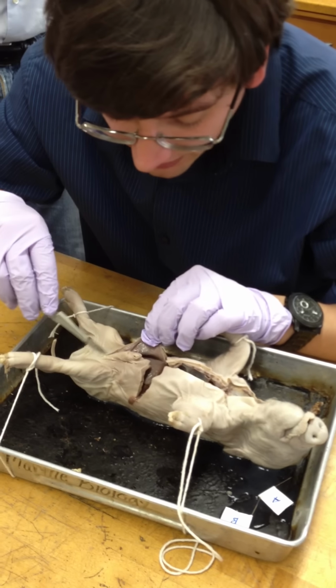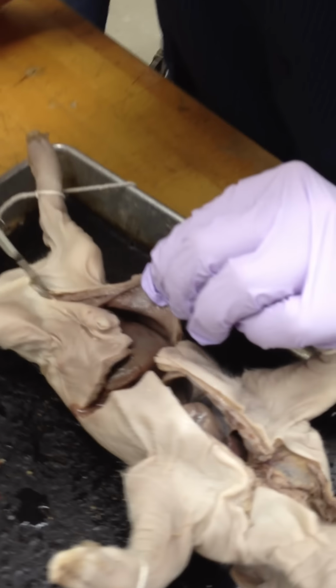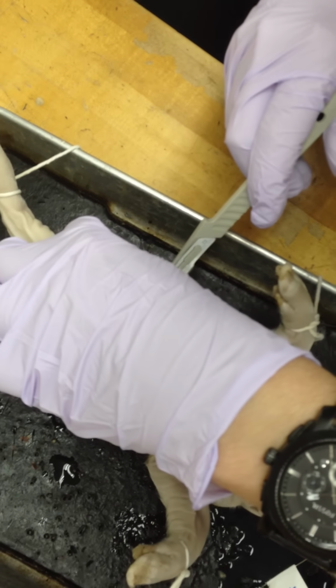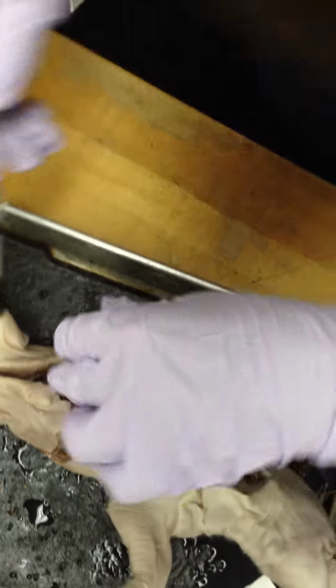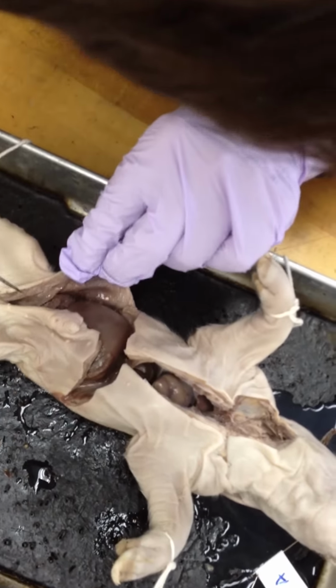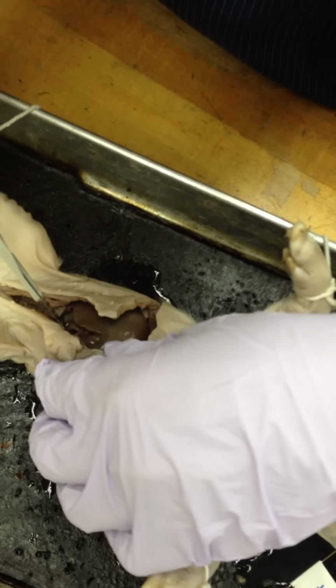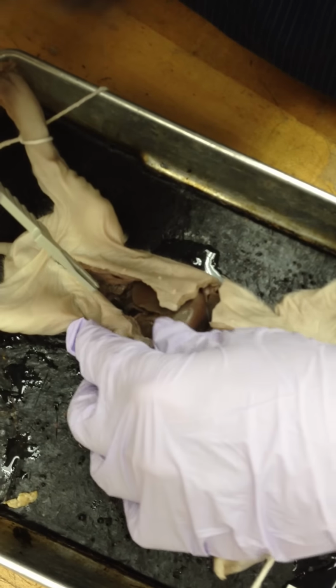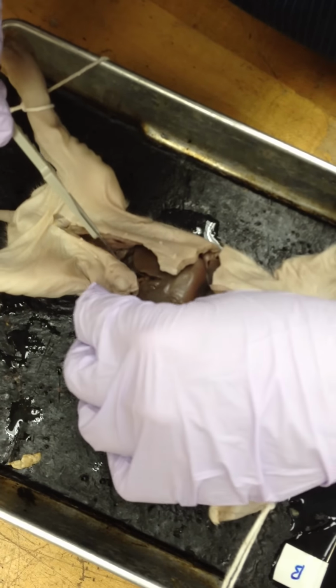And there's the digestive tract. Do we put the microscopes out, or do I have to put the urinary tract slides over there? Yeah, so this is definitely the umbilical cord. As you can tell, this is directly attached to this vein that's going through the liver. We did not use the slides last time.